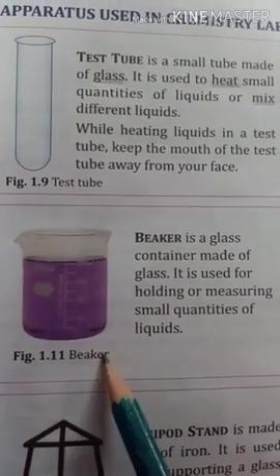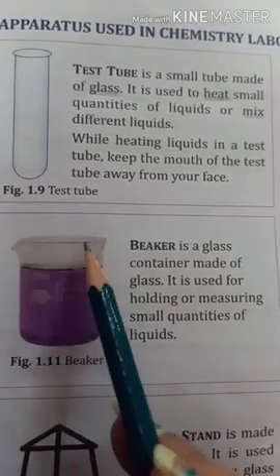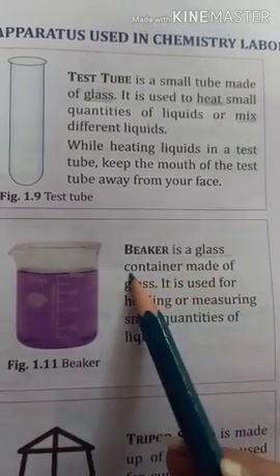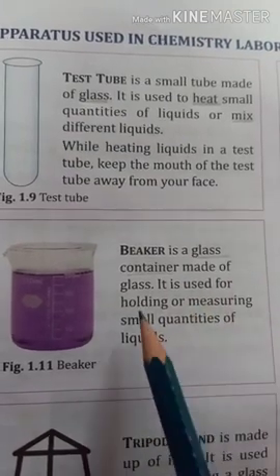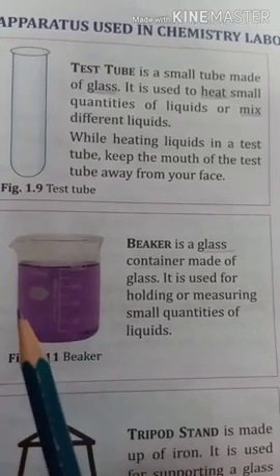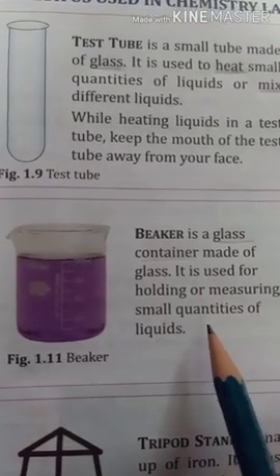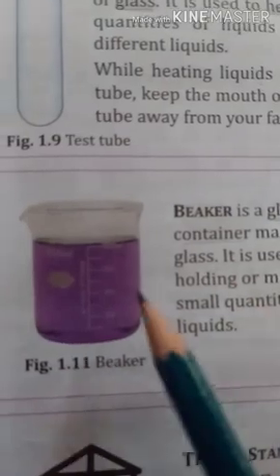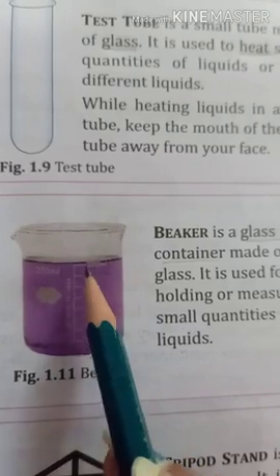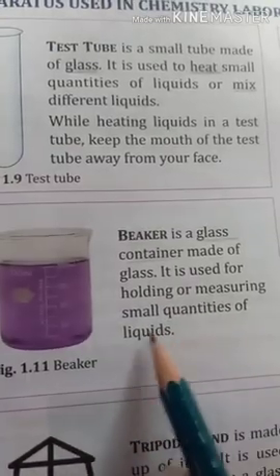Next apparatus is the beaker. Beaker is also made up of glass. This is a beaker, and this beaker is also made up of glass. So that's why it is called a glass container. So it is used for holding or measuring small quantities of liquids. So we will hold a small quantity of liquid in this beaker, or we will measure a small quantity of liquid in this beaker. So here you will see that we have a numbering 50, 100, 150 and 200. So this beaker is used for measuring small quantities of liquids.